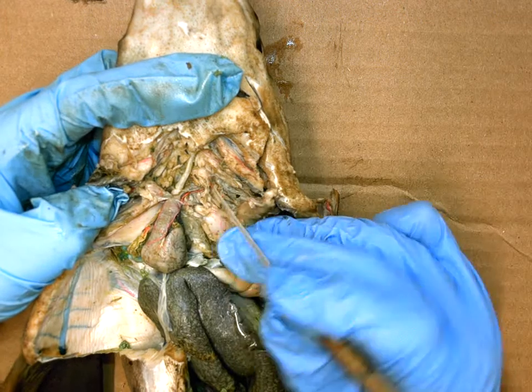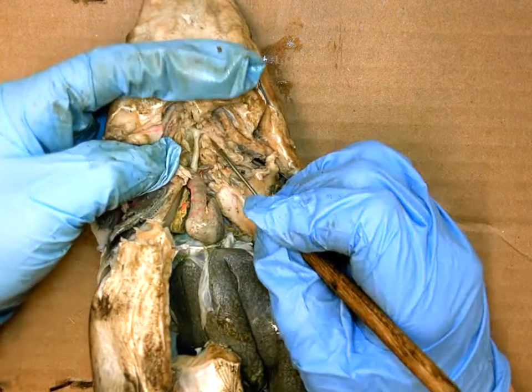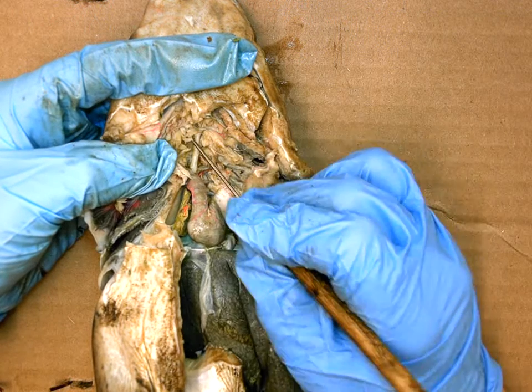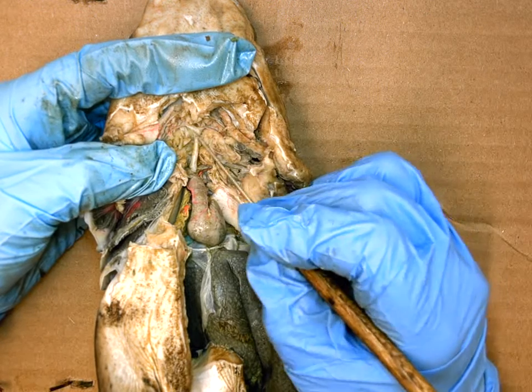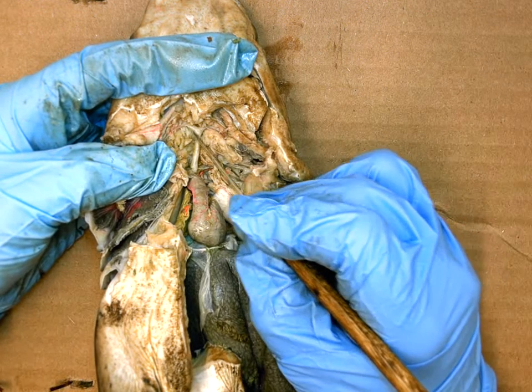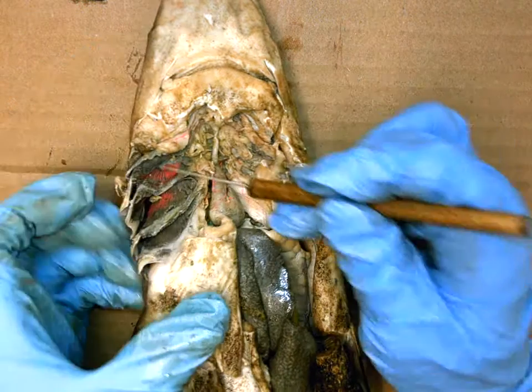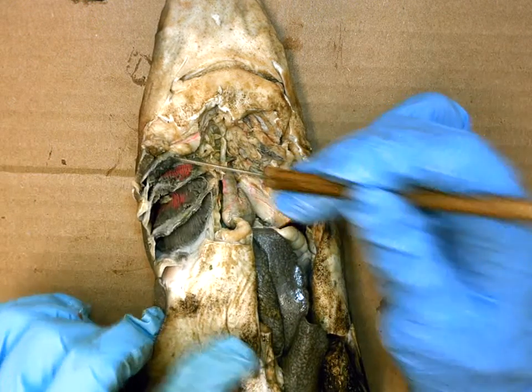The branches off to the side from the ventral aorta form a V shape, shooting off to the sides. These side arteries are called the afferent branchial arteries, which bring blood to the frilly gills in order to pick up oxygen.